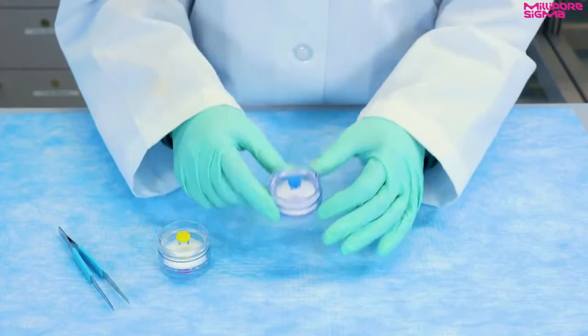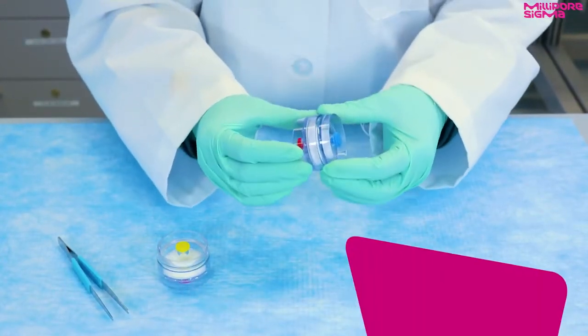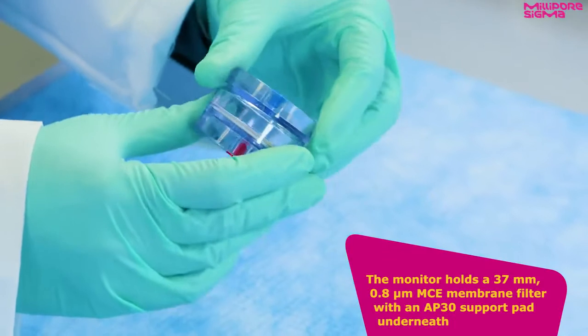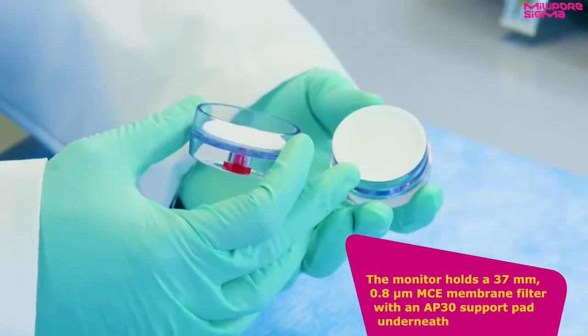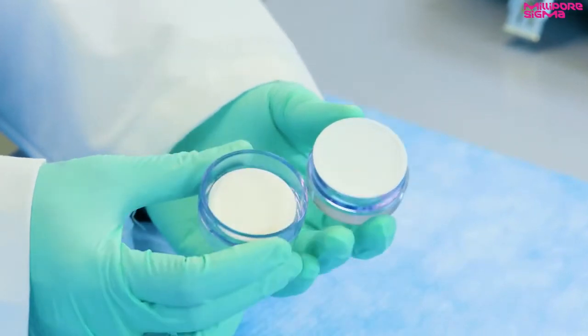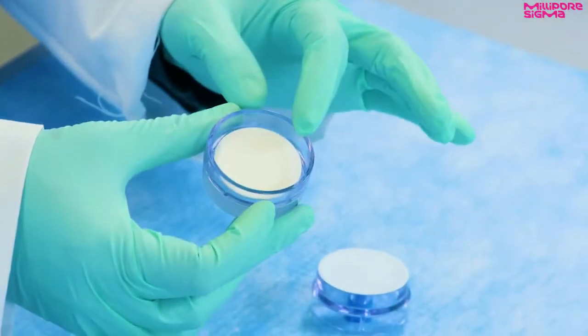Now let's take a look at the two-piece monitor in detail. The monitor holds a 37 millimeter 0.8 micrometer MCE membrane filter with an AP-30 support pad underneath. This thick filter pad provides support for up to 100 psi maximum pressure.